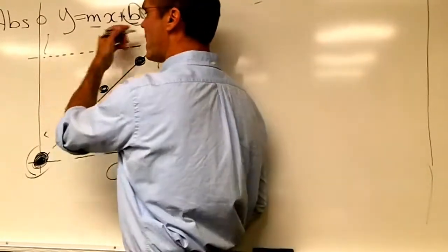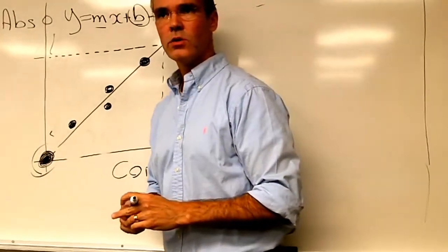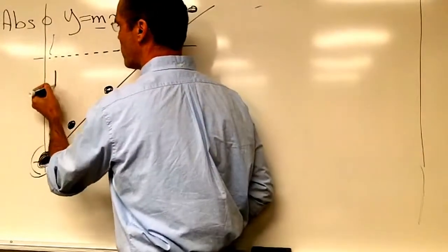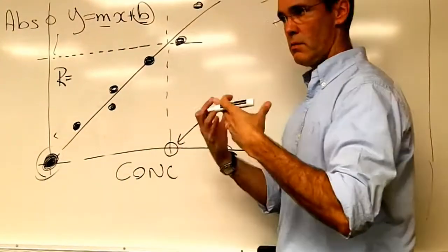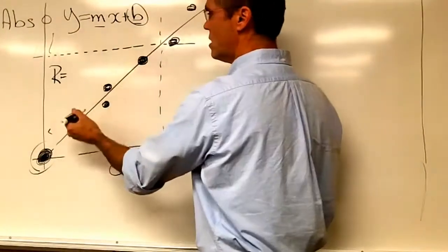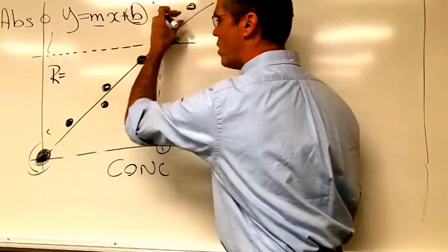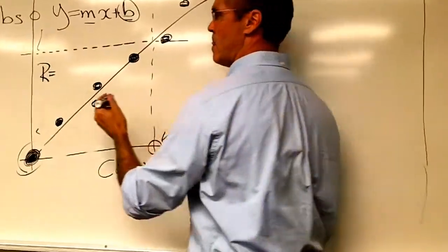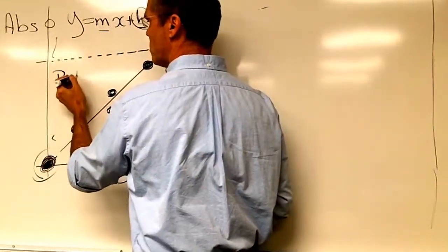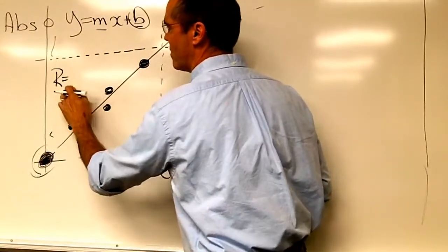And the trend line, which your calculator or a computer would give you, comes with the R, so you can calculate the R. I'm not going to get into this, but the R, which measures how close your points are to this actual trend line, should be as close as possible to 1, 1 being all the data points on the line. But that never happens, right?